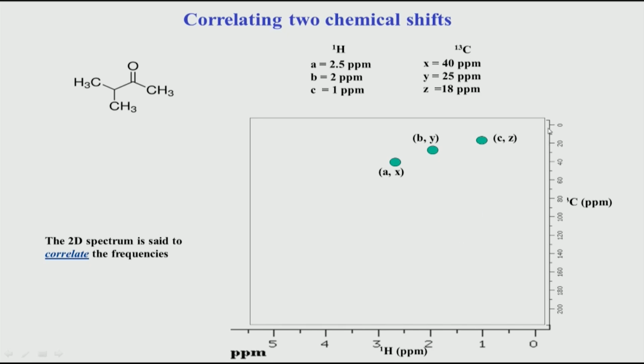So, remember again, I have not generated this 2D spectrum from my 1D spectra. 1D spectra were done separately and the 2D spectrum is recorded separately. So, please do not confuse that this 2D spectrum which I gave as an example is coming from the combination of the 1D which we saw in the previous slide. That is a separate thing. We recorded 1D separately, and we record 2D separately. This is not generated by combining the two 1Ds, it is generated by a different method which we will see. By doing a 2D I am able to get that ambiguity resolved.